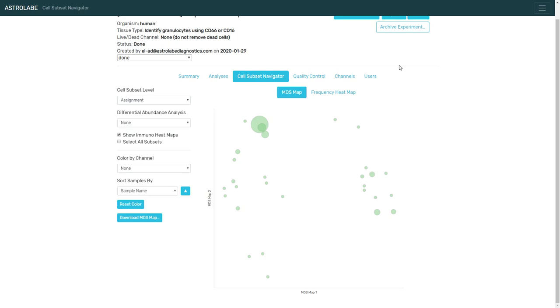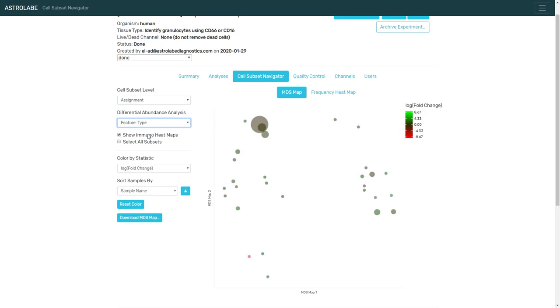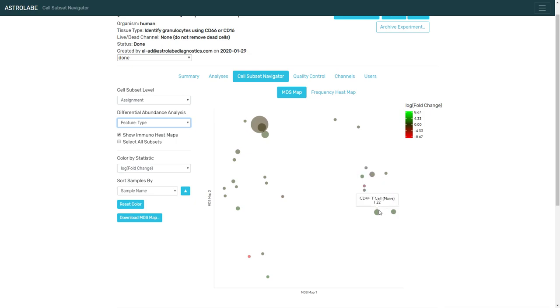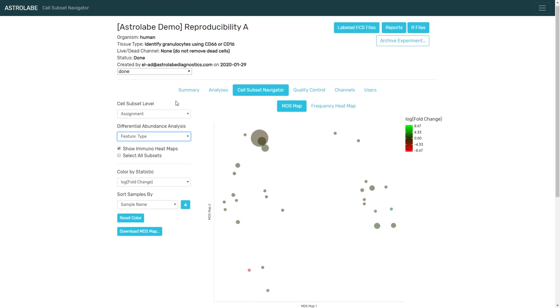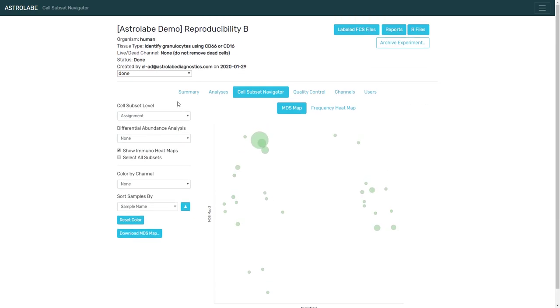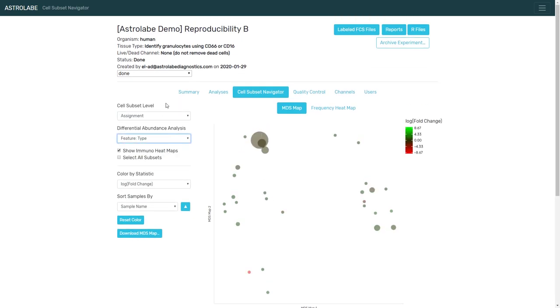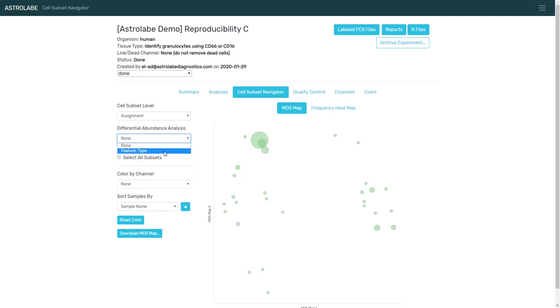And just to take this a step further, let's compare the frequency of the different cell subsets between the patients and the controls. So in this view, the subsets are color-coded according to patient versus control. The deeper the color, the greater the change. Let's move to reproducibility B and color-code it. Let's move to reproducibility C and color-code it, exactly the same results.